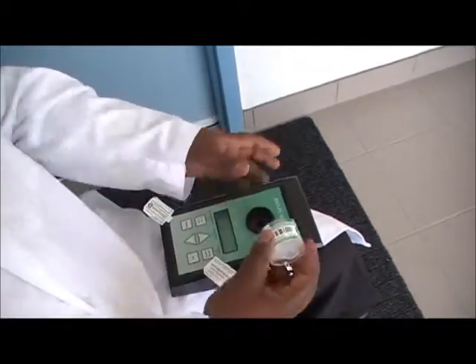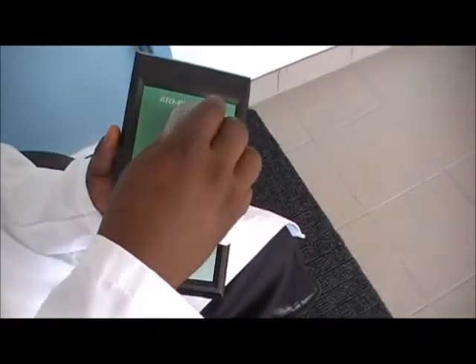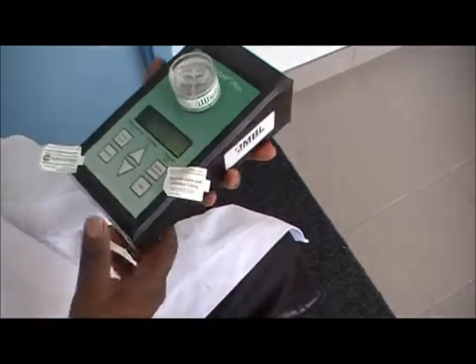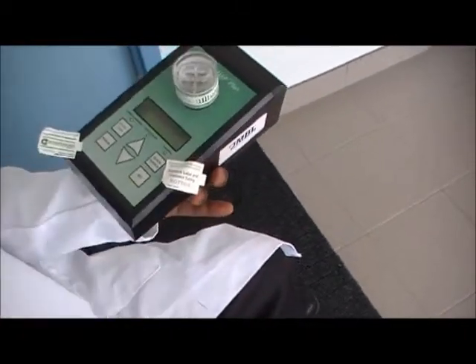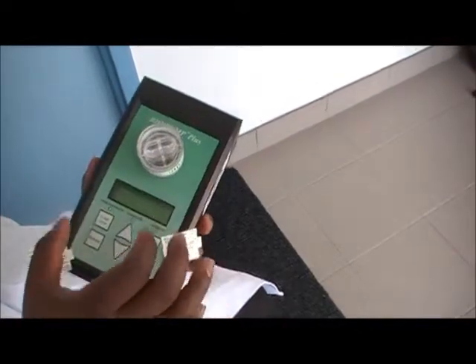Ensure that you place this cassette into the adapter for the pump. You can see now the cassette is nicely put on the pump.